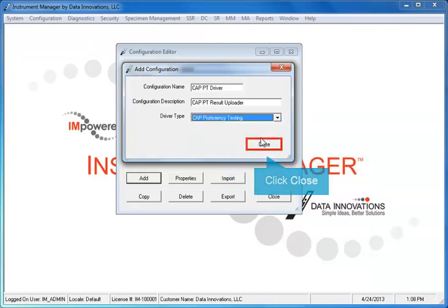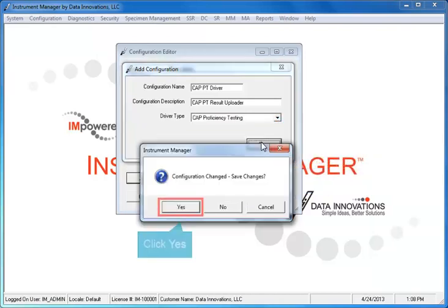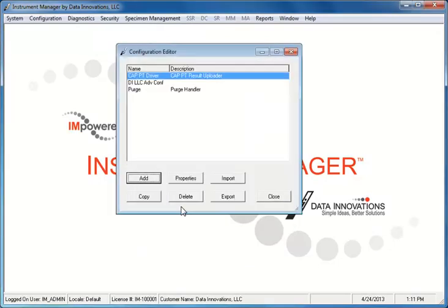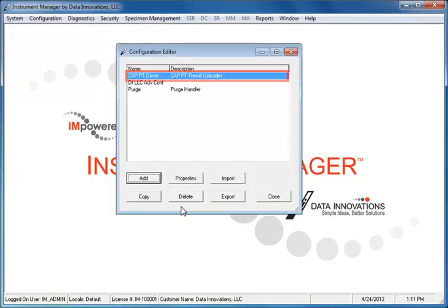Click the Close button and click Yes to save your changes. A configuration for the CAP driver has been added.